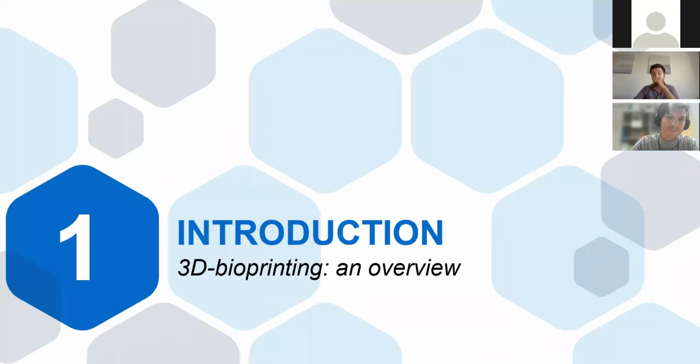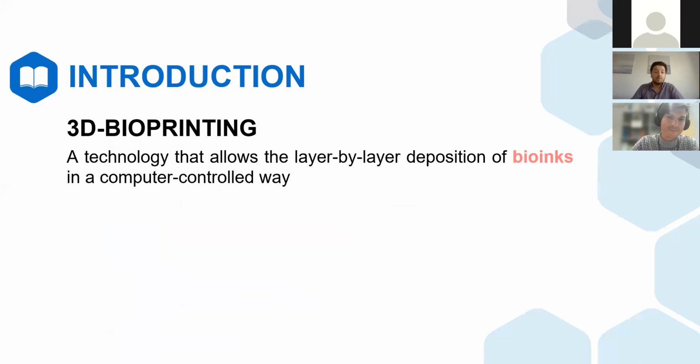As I was saying, 3D bioprinting, I'm sure you've all heard of 3D printing, the layer by layer deposition of certain materials to create a new object. In this case, when we talk about 3D bioprinting, most of the times we talk about the layer by layer deposition of bioinks.